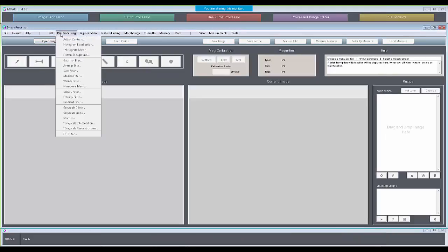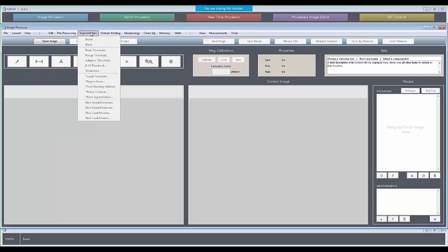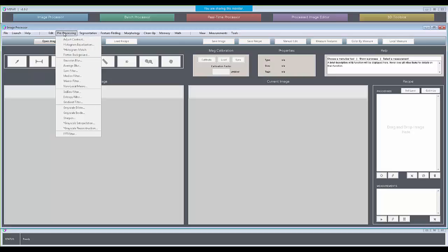I know some of you might have air-gapped PCs and other things that you're working on. So then we move into our processing functions. We'll review these in more detail, or at least those that we make use of today. But here are your basic cropping, resizing, rotating, sort of your dimensional manipulation operations, your grayscale intensity manipulation functions here that are usually done prior to any sort of feature detection steps that usually make those steps easier to operate.